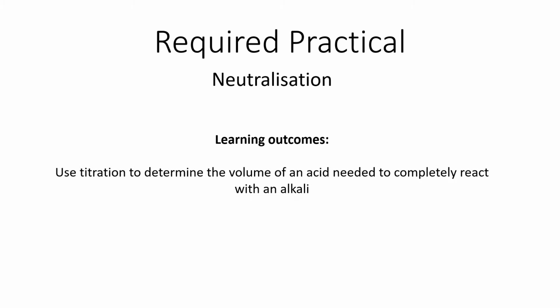Okay, so this required practical is about titration and using titration to neutralise a substance accurately. So the learning outcome is to use titration to determine the volume of acid needed to completely react with an alkali.